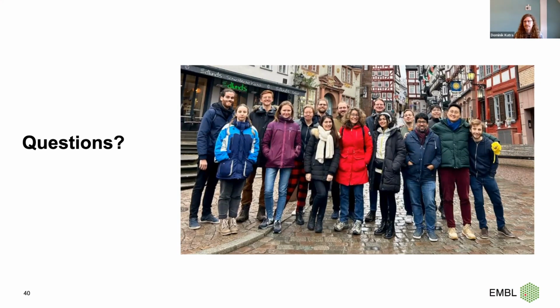I guess you've tried a couple of those. How well does that work? Because I always had the impression that it matters quite a lot how you record your images. If you have a slightly different microscope and setting, you might get different kinds of data, and then it might not work so well. So you need training sets that are done with the same hardware, for example. How well does it work to use these models from other people?